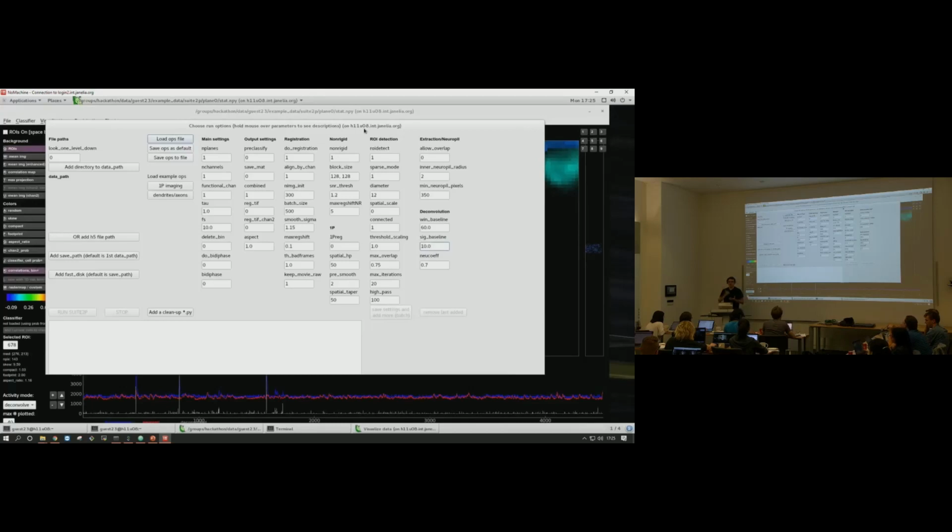So this is the one step where you want to be sure that you've done everything you can already in hardware, in the actual setup that you have, to reduce it as much as possible. So I thought, because you guys all do imaging, this is something that you've already probably dealt with. So just collecting everyone's tips and tricks for how to keep recording stable, I think that would actually be pretty useful.